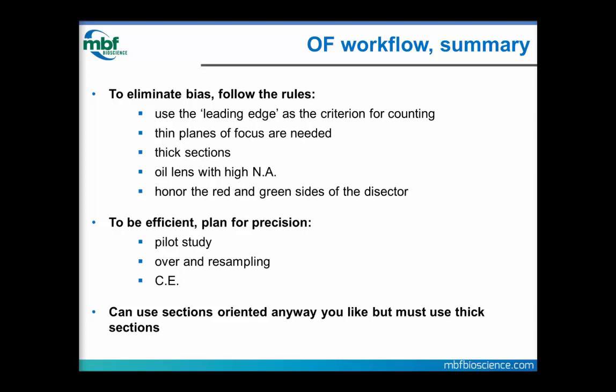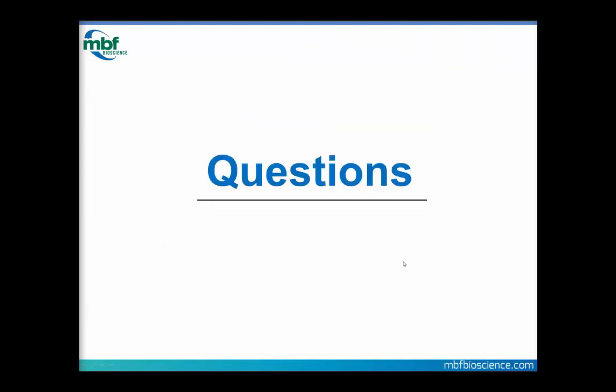There's a couple different styles; different labs like different styles. We can help you choose one of those. It's a pretty forgiving probe in that your sections can be oriented any way you like, but we must use thick sections. Okay, I'd like to pause, and I see some questions are coming in here.